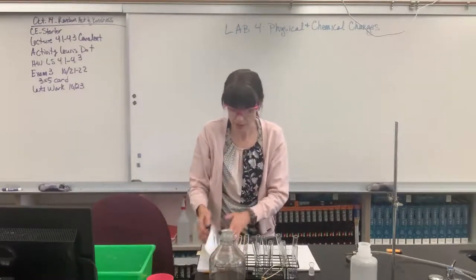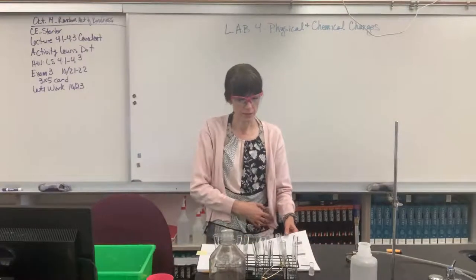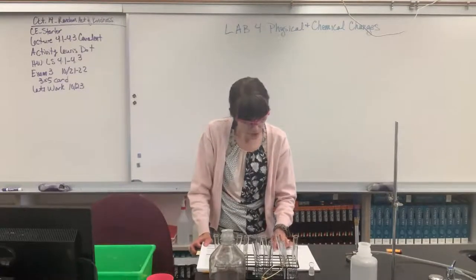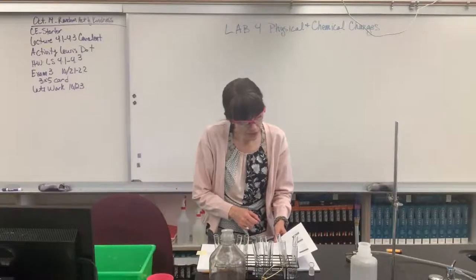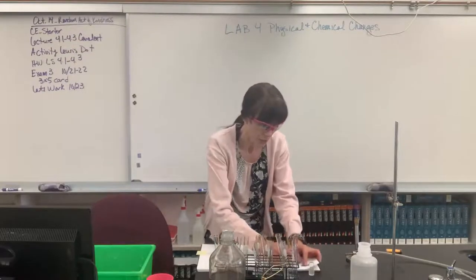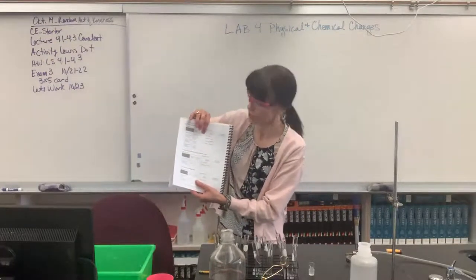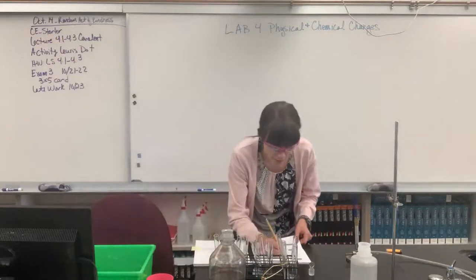Let me set this down just a minute and go back to page 54 in part C. Okay, this part we didn't have to record. Let's go to step 9. I added my 30 drops of water. It says add drops of water as needed to dissolve. Note, record the color of the resulting solution in table 4.5 under melted sample. Oh, sorry you guys, I had you put red, erase that. Let me show you really quick. Where it said melted sample, right here, that's where we're supposed to put this next yellow. So it'll actually say yellow and yellow. So right here, it says melted sample in solution, put yellow. Sorry about that.